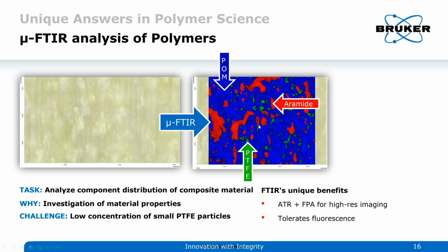If you try to do this by Raman, the Raman might work, but sometimes you can have fluorescence, but by the IR you don't have that.